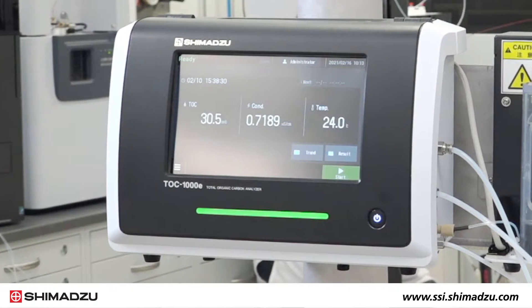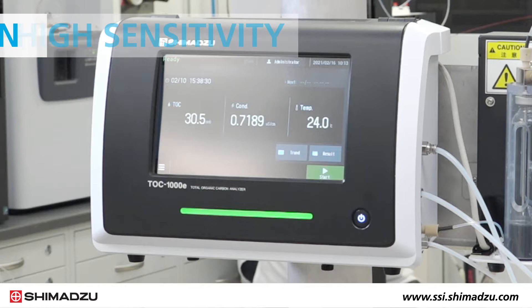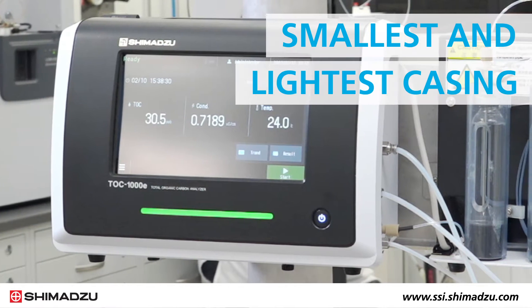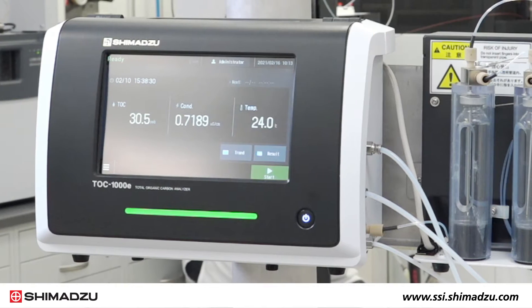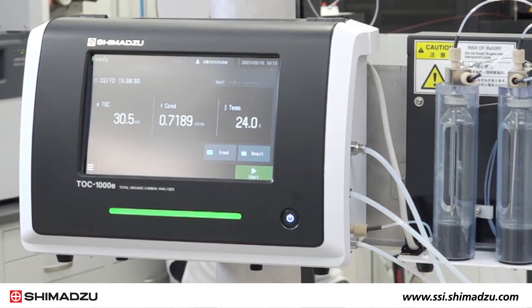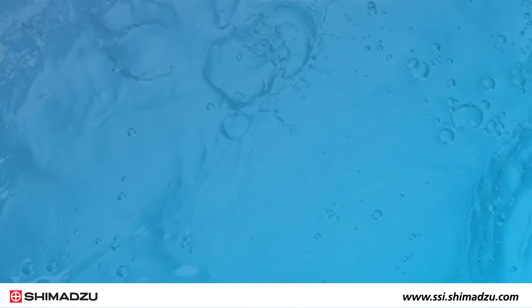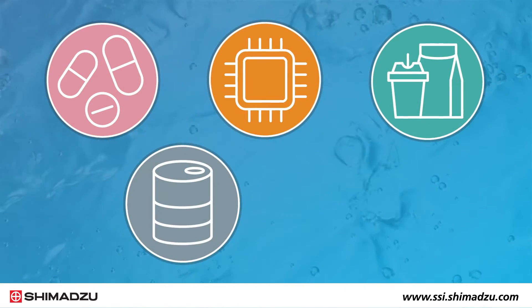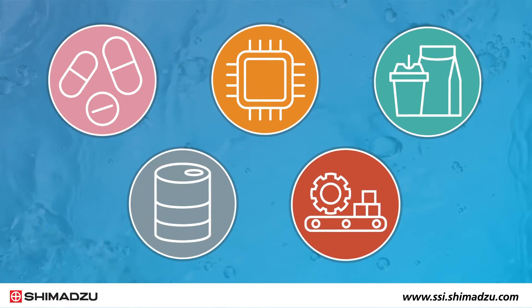The TOC1000E provides high sensitivity with a low detection limit of 0.1 micrograms per liter in the smallest and lightest casing available on the market. It is ideal for industries requiring ultra-pure water, including pharmaceuticals, semiconductors, food and beverage, chemical packaging, and precision equipment manufacturing.